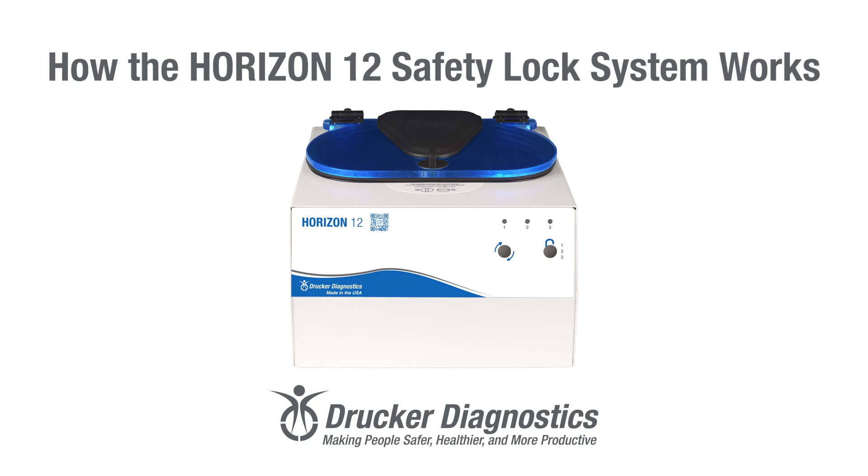Hi, I'm Dawn with Drucker Diagnostics and today we're going to learn about the safety lid lock system on the Horizon 12 and how the Horizon 12 safety lock system works.